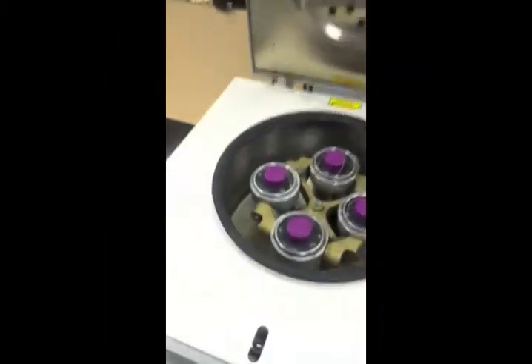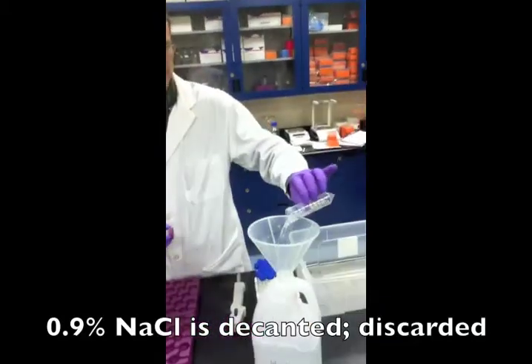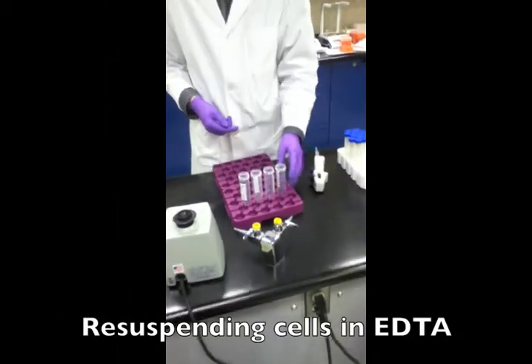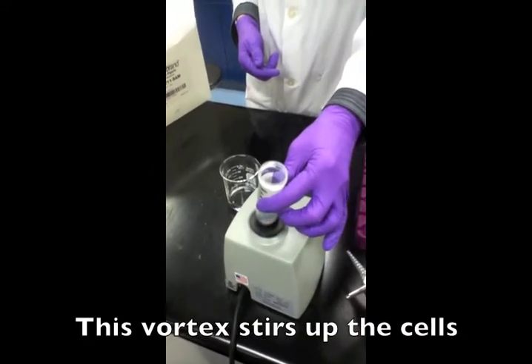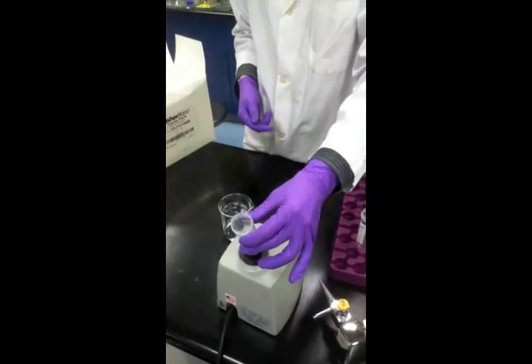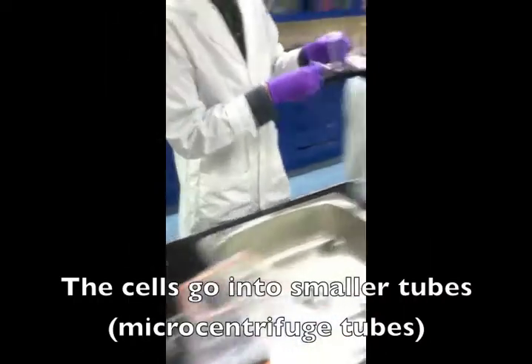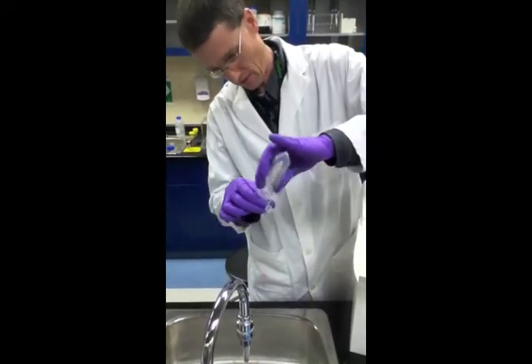Open the top. Resuspending the cells in a Tris EDTA buffer. The EDTA will chelate magnesium ions, which will prevent DNA enzymes from being active. Just pour off a few hundred microliters.